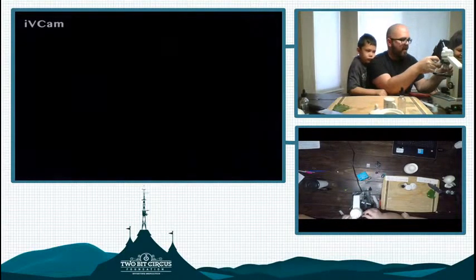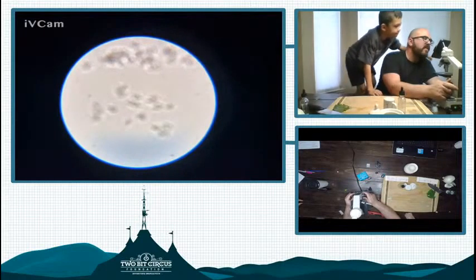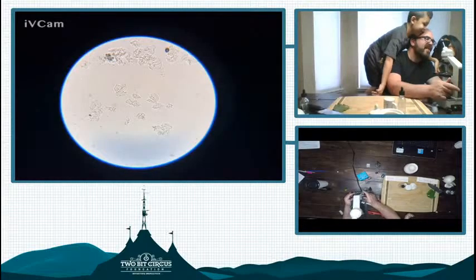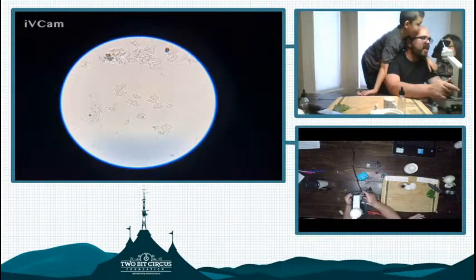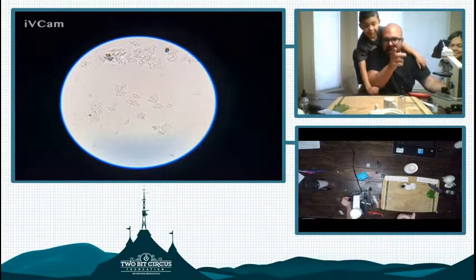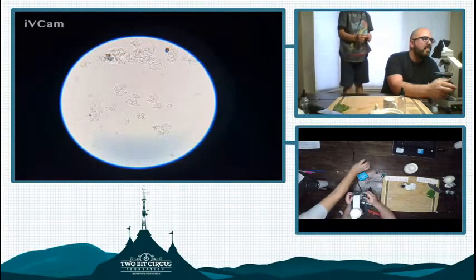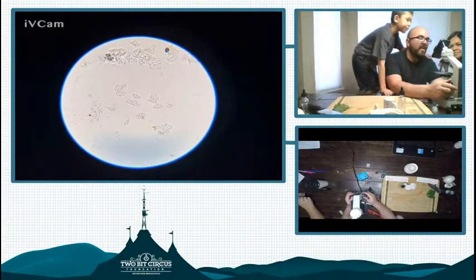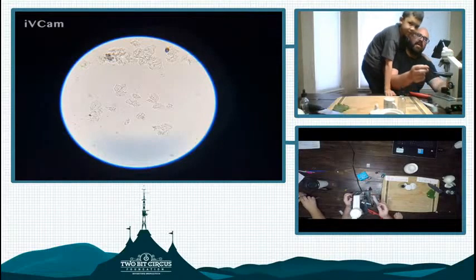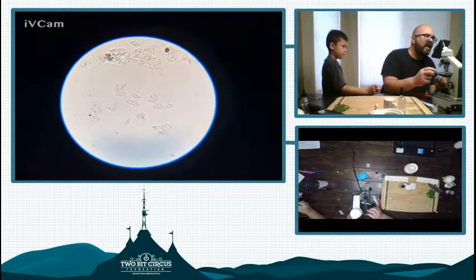Why don't you come over here between us so that you can see the closer camera better. They are cells. They are cells. And these are actually really good cells. You could actually see stuff in them, like maybe there's parts inside of a cell. Can you see that on that camera? I think you can a little bit. And Robert, look, I'm going to use the other one real quick. Do you see those dark points in the cells? I wonder what that stuff is. Okay, sit down for a minute because I'm going to move the slide. I don't want it to drop. So you can see that I think Robert is alive.